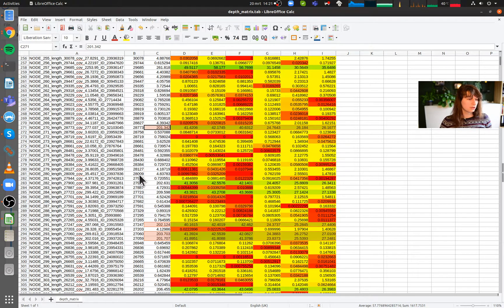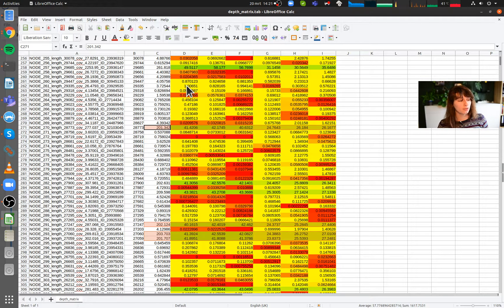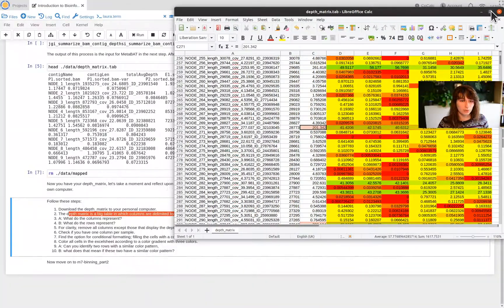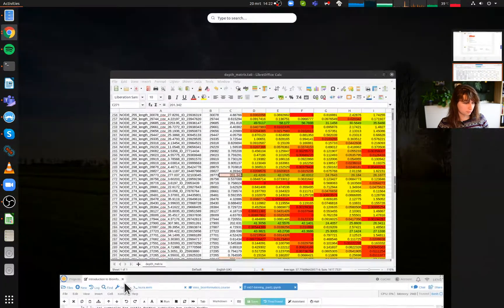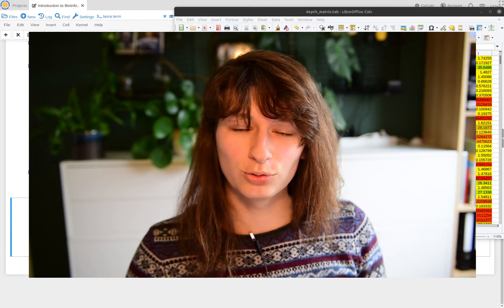So this is a visualization of what the binning process does for us, at least in part. Remember, binning uses multiple binning signals to determine which contigs together should constitute a genome. The coverage depth is just one of them. The other important one is sequence composition, or k-mer profiles — the same thing. For now, you've successfully completed this assignment. Well done — we'll go on to the next notebook.